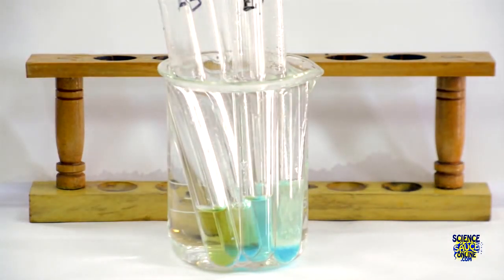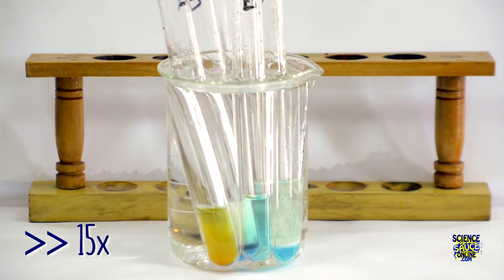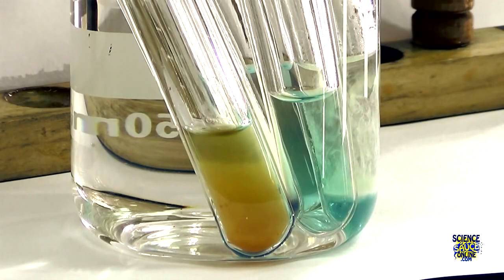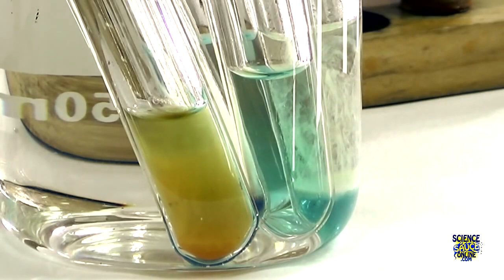It does take some time for a reaction to occur, but if we watch this speeded up, you can see that one of our samples is clearly turning a kind of yellowy orange colour, and this indicates the presence of a reducing sugar. When we put them back into the test tube rack, we can see that fruit juice is the only one that's actually reacted to this, suggesting that it contains reducing sugars.